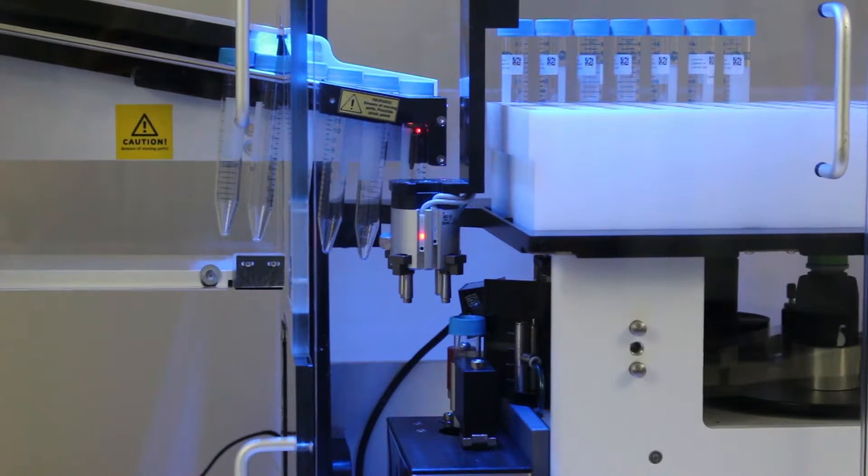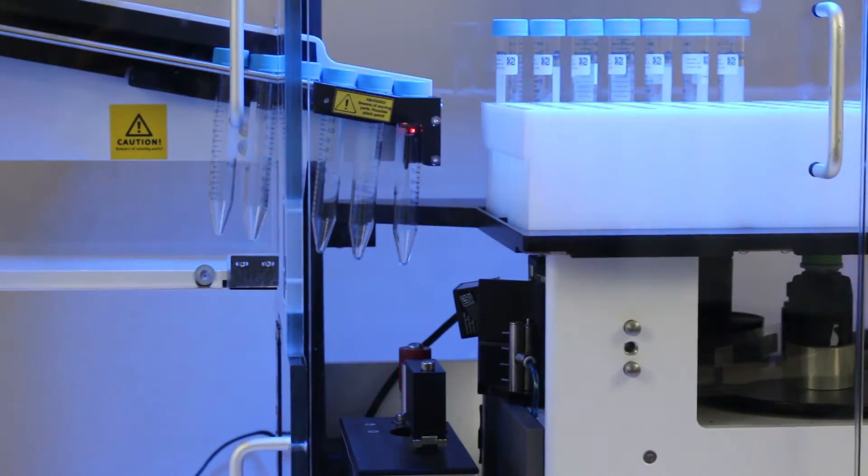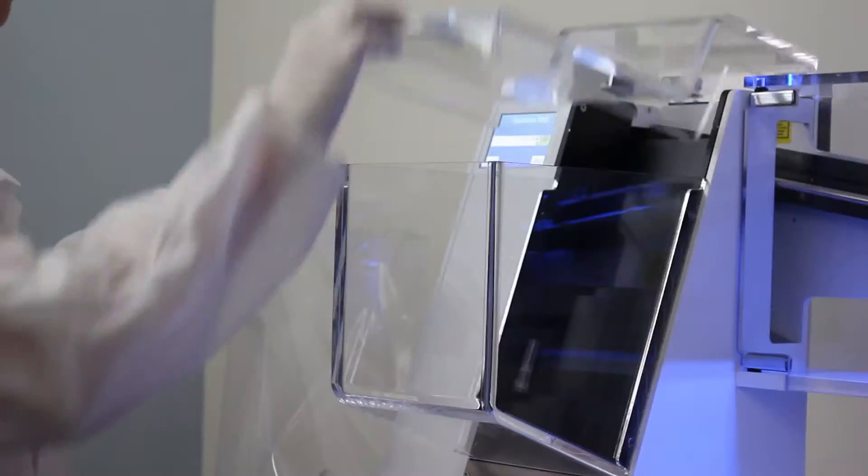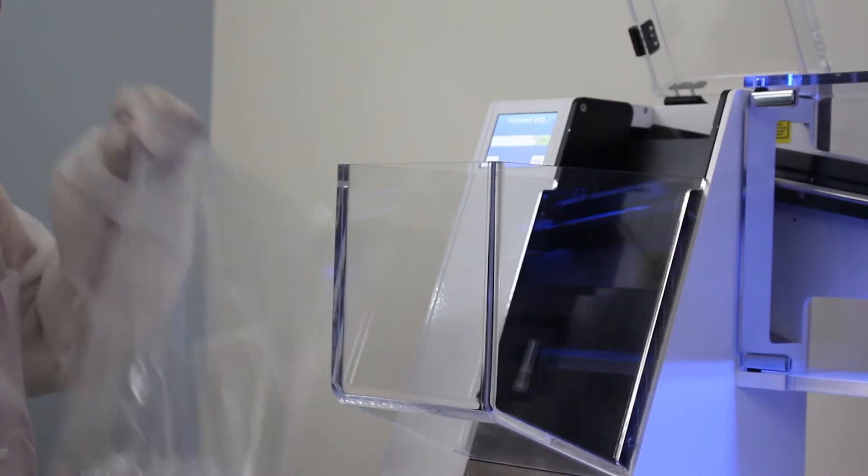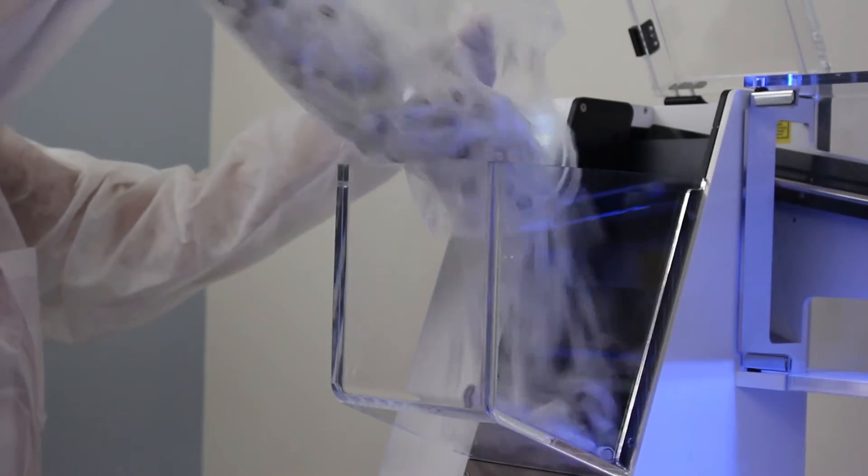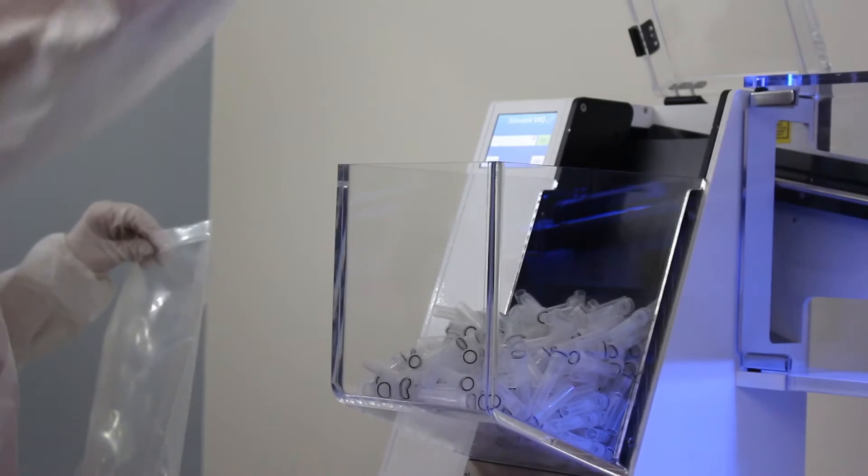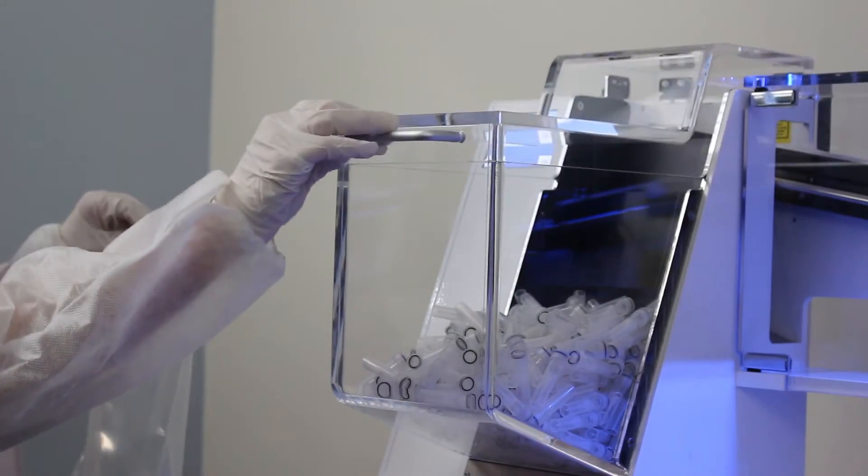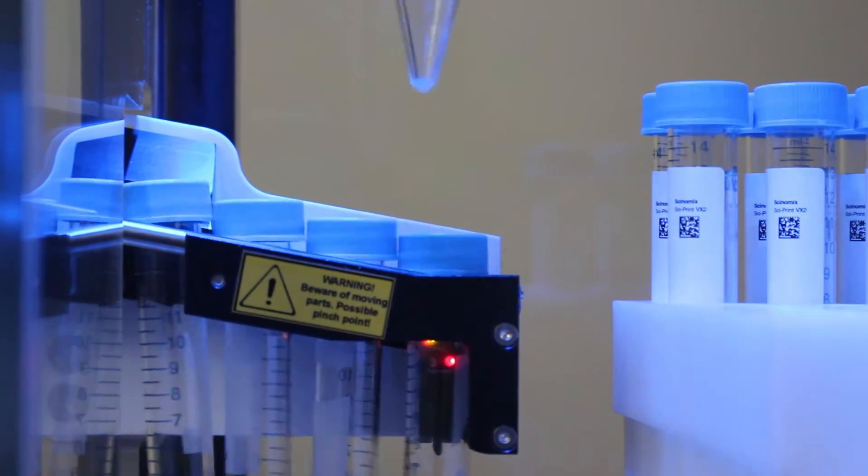The system easily attaches to the SciPrint VX series and can be seamlessly retrofitted in the field to existing machines. Bulk tubes are loaded into the hopper that is compatible with a variety of tubes ranging from 0.5-milliliter cryovials to 15-milliliter conicals and vacutainers.